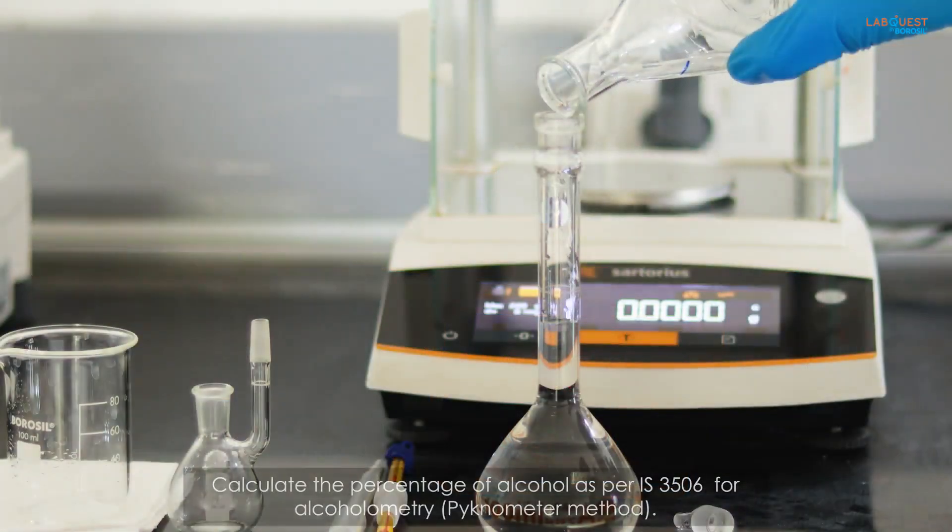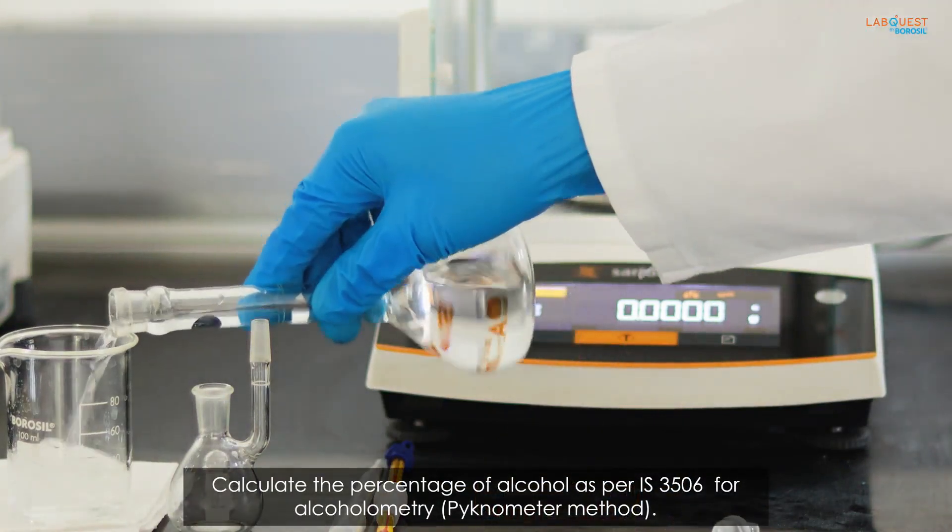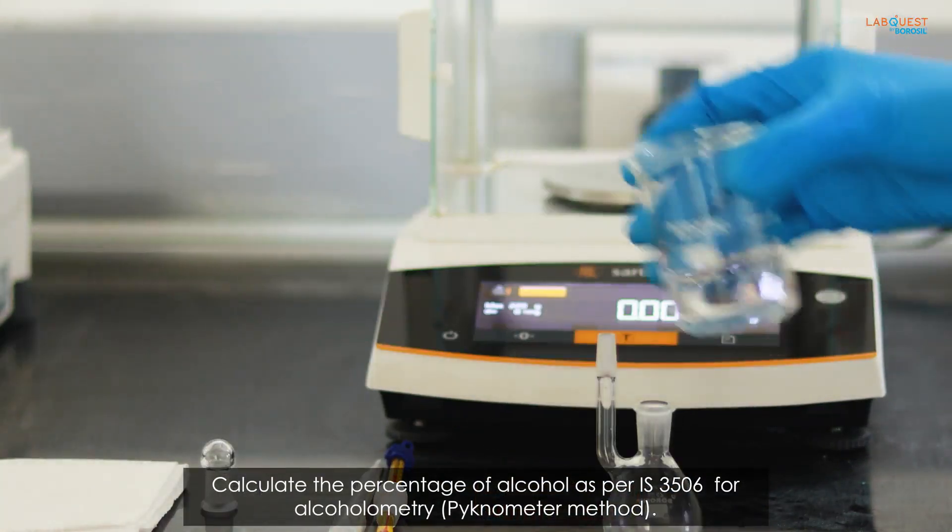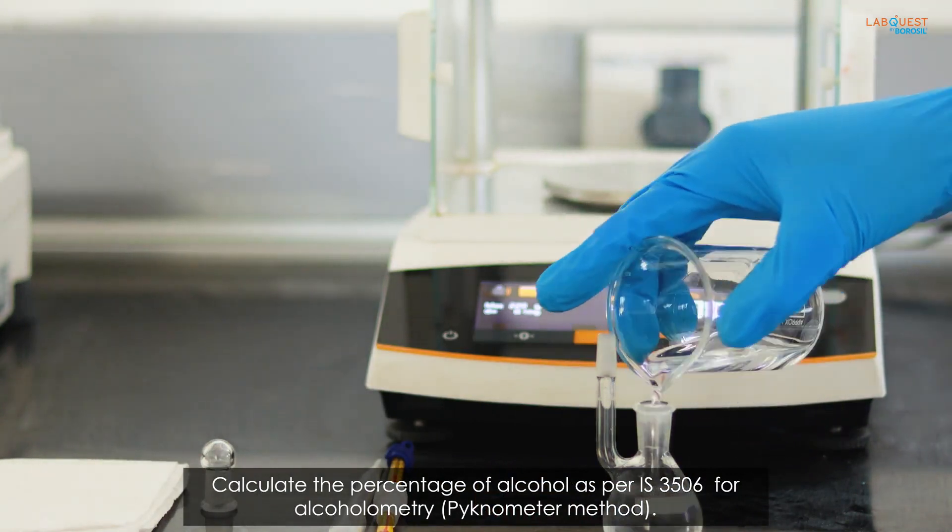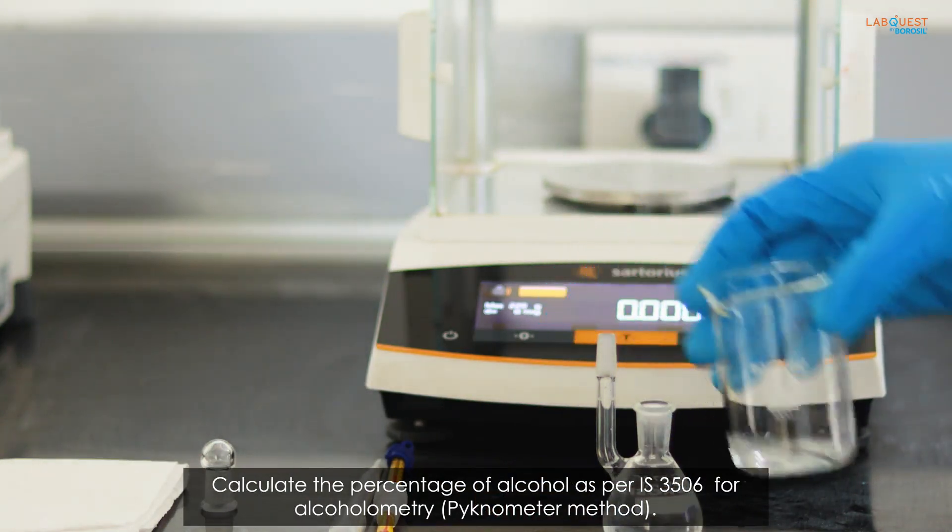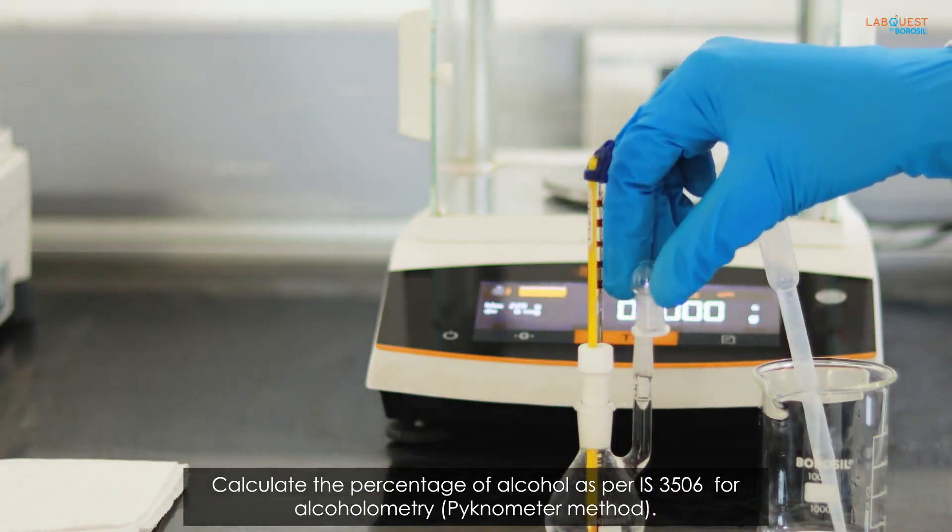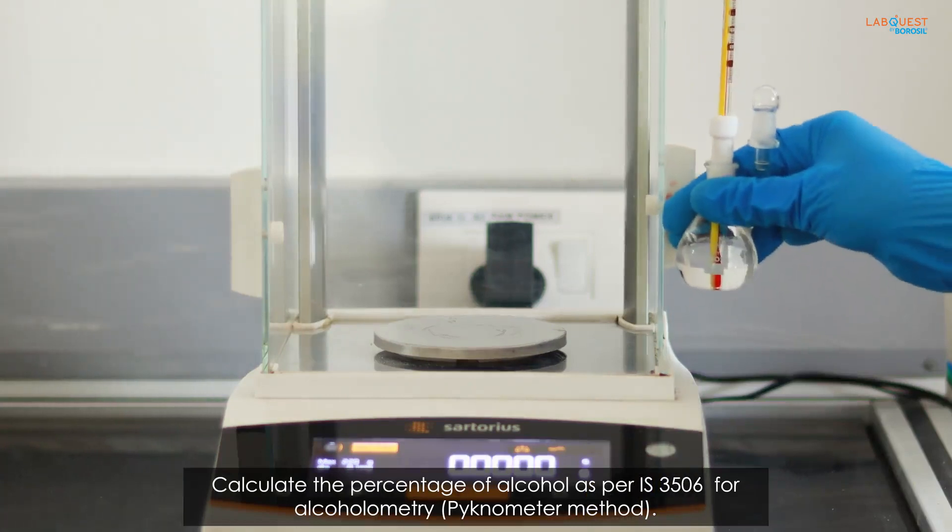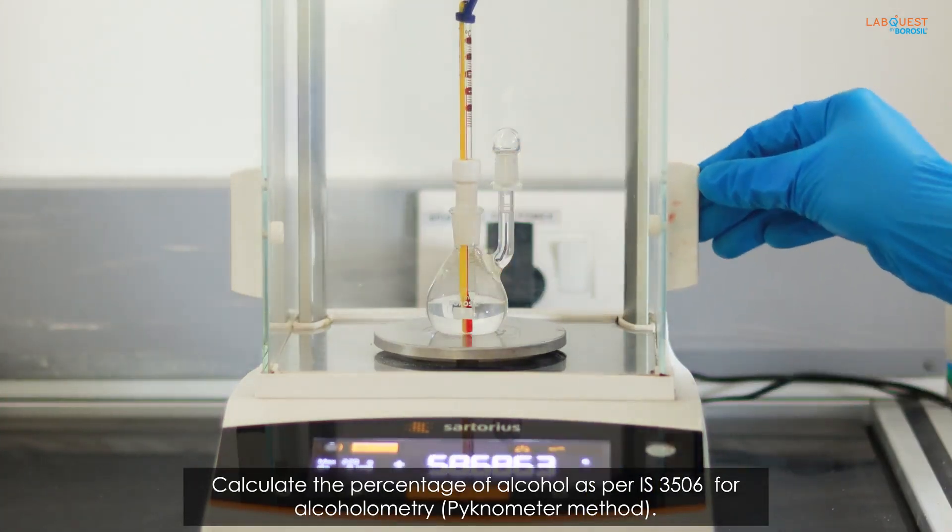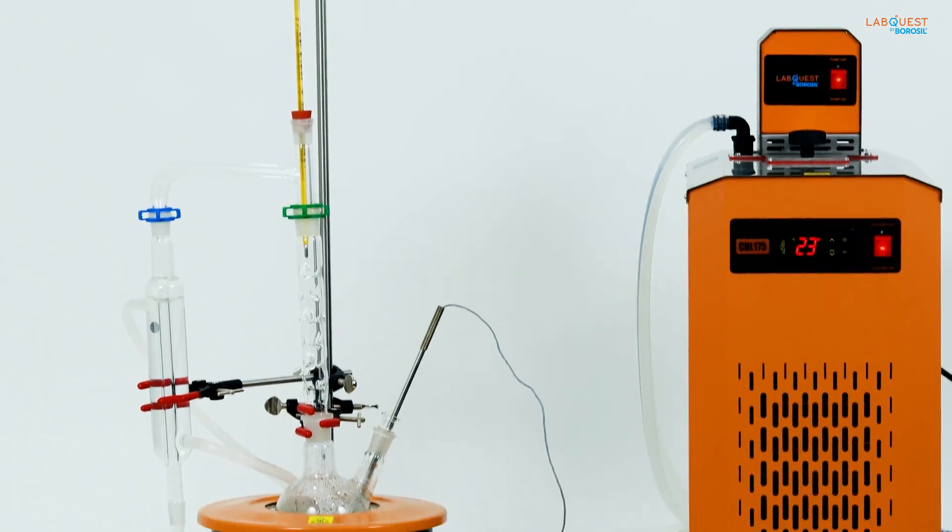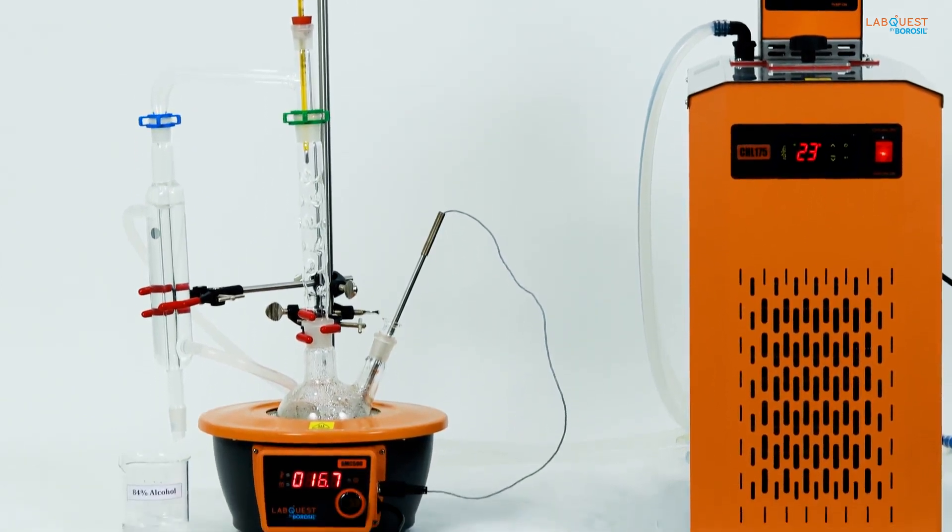Calculate the percentage of alcohol as per IS3506 for alcoholometry by pycnometer method. Here we get 84% of alcohol using accurate temperature.